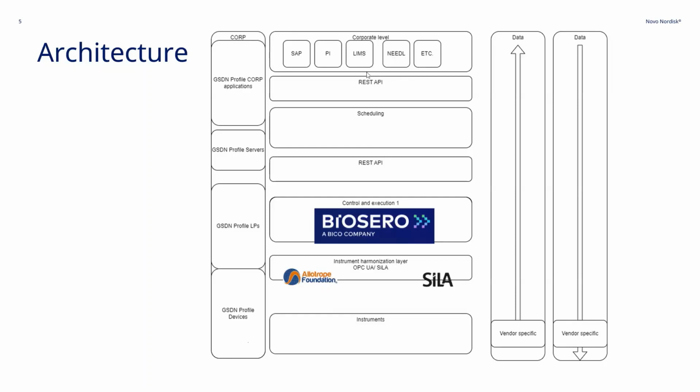The data lake and the LIMS system and whatever it is. And then see this small section as a physical laboratory where all the devices are connected to the network blocks with an Ethernet cable. And that's where the computer connects to the devices.